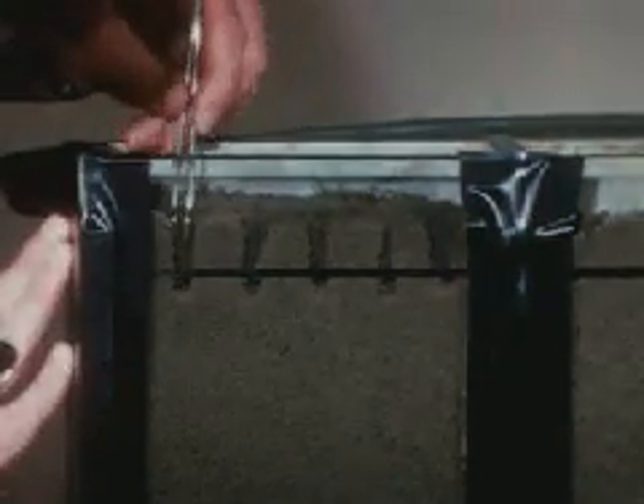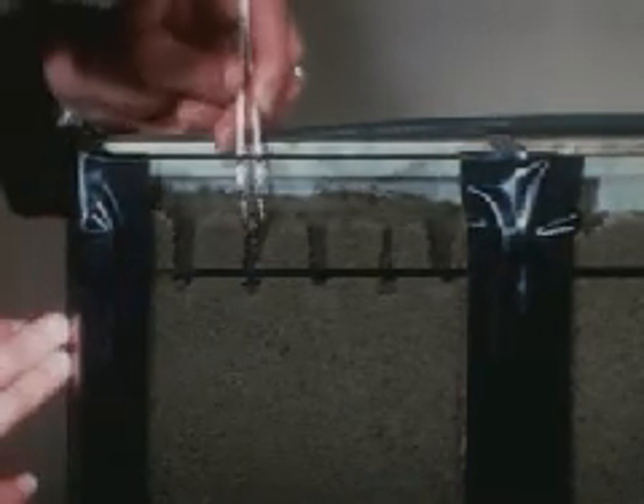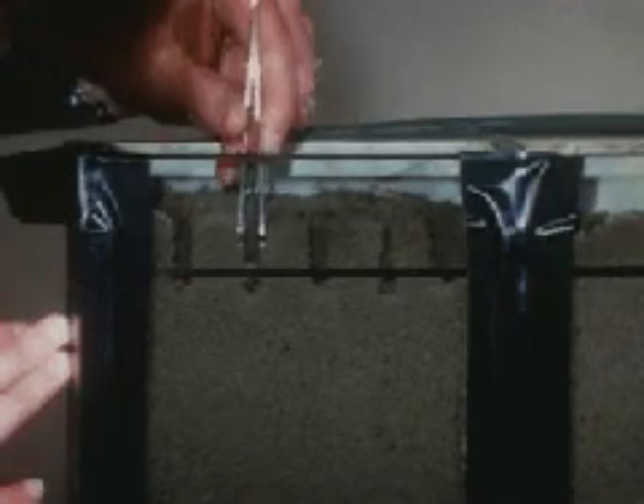Planting must be done with care to avoid injuring the delicate hypocotyl tip. Each seed is placed into a prepared hole with the emerging hypocotyl pointing down.